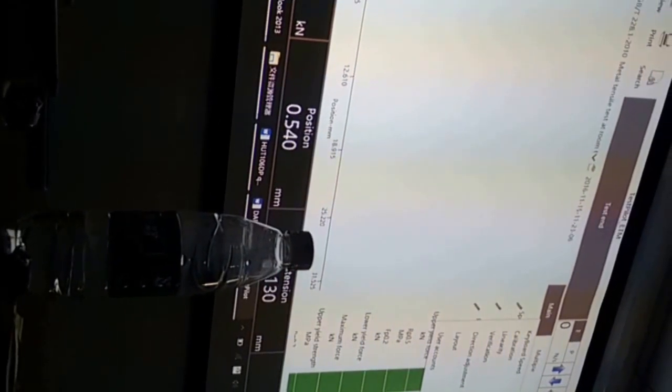System. Here you can adjust the system for your needs. The first one is user accounts. Usually they have admin and operator. So you can choose here. Here it's only the tester account, but usually they have an operator account also.